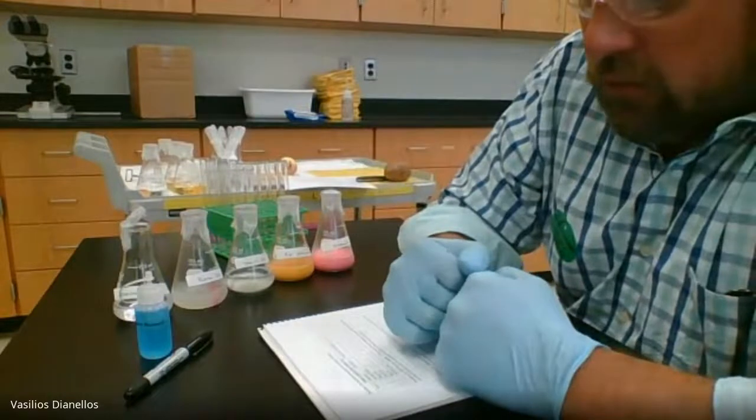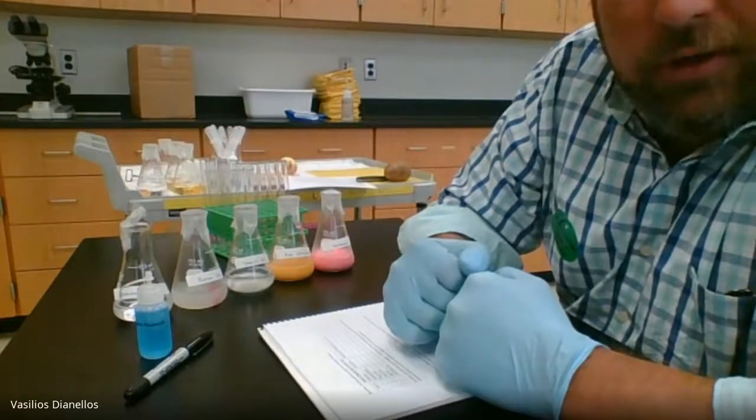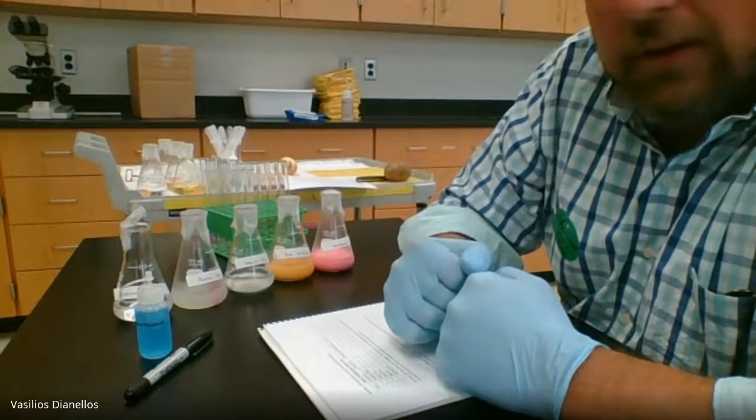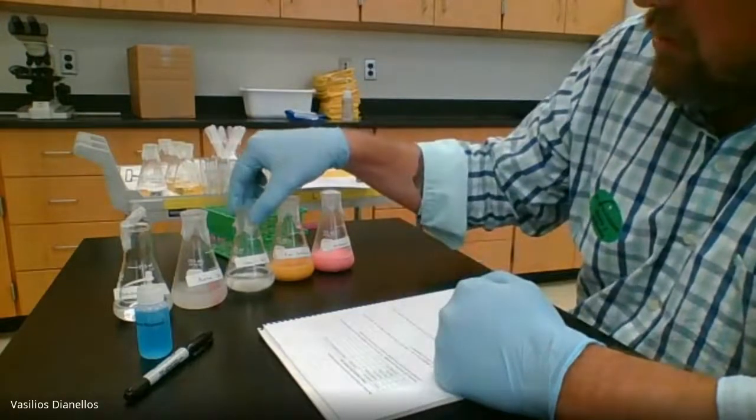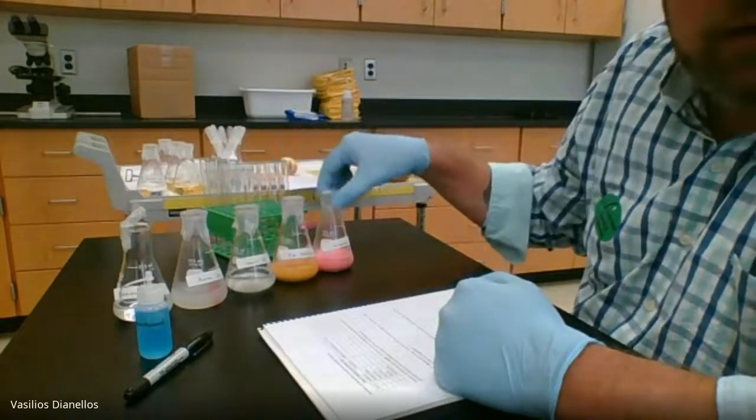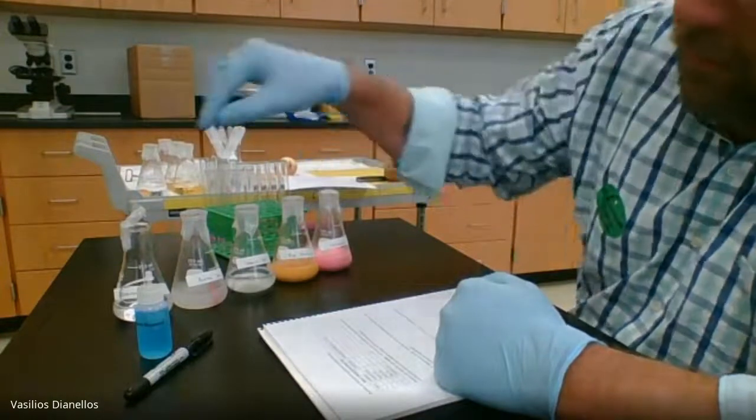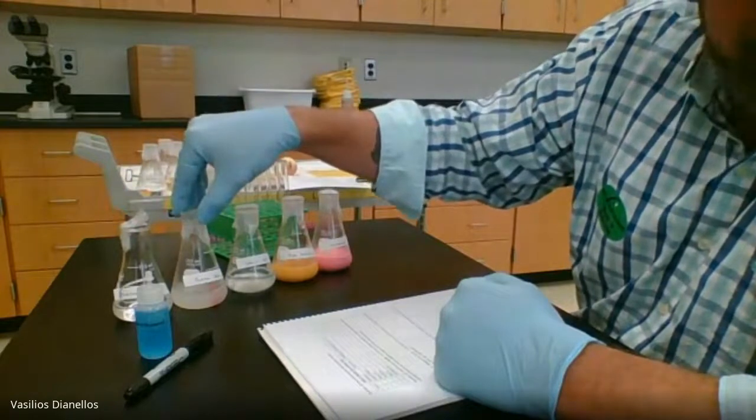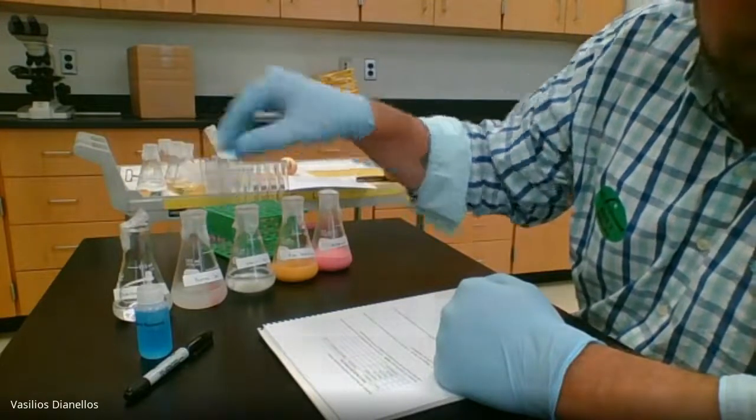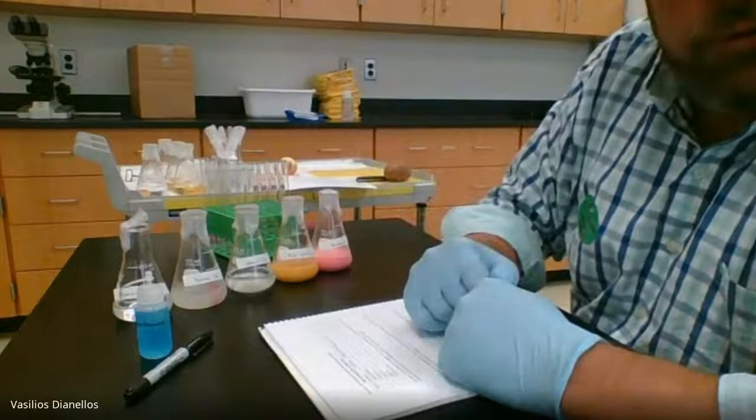you will want to go to your lab worksheet and write down your hypotheses for the amount of protein in each liquid: the starch solution, the egg solution, and the unknown solution. The distilled water is the negative control and the pepsin solution is the positive control, so there is no need for hypotheses for those two solutions.